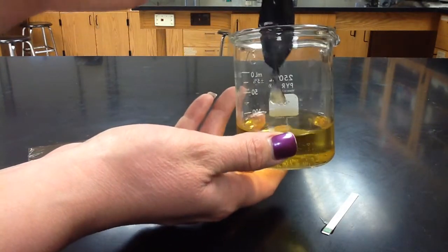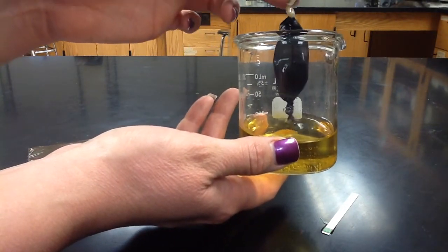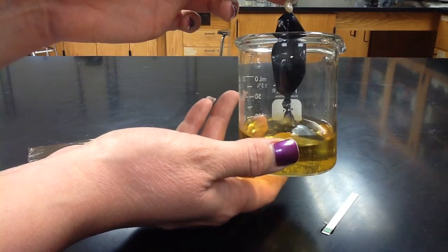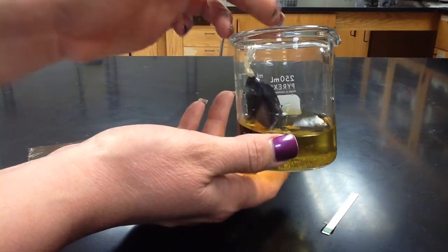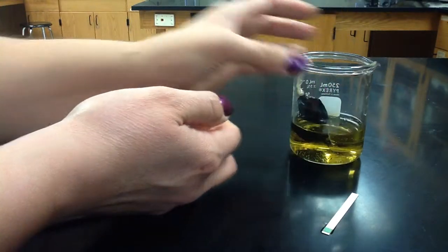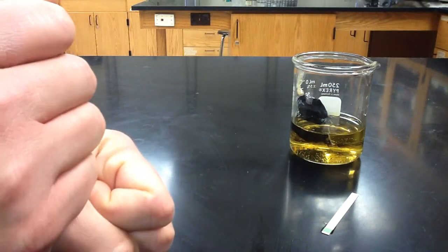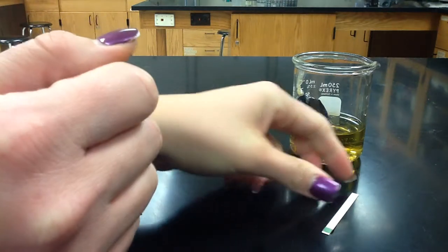And remember, if starch comes in contact with iodine, it turns a dark blue. So what this means is that the iodine has moved into the tube, but the starch did not move out of the dialysis tubing.